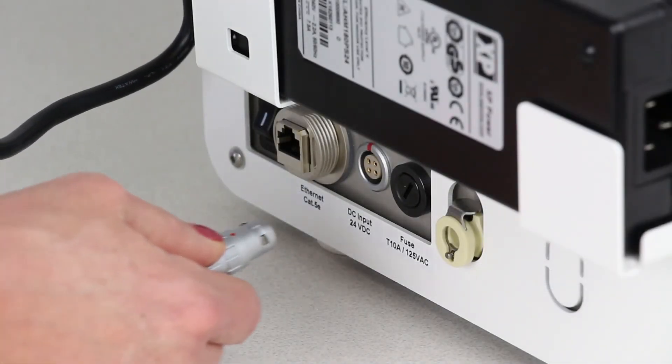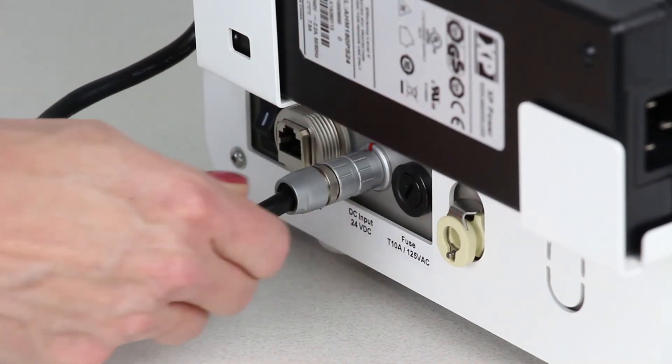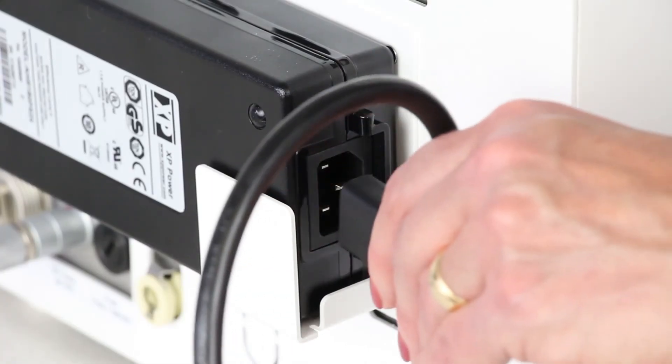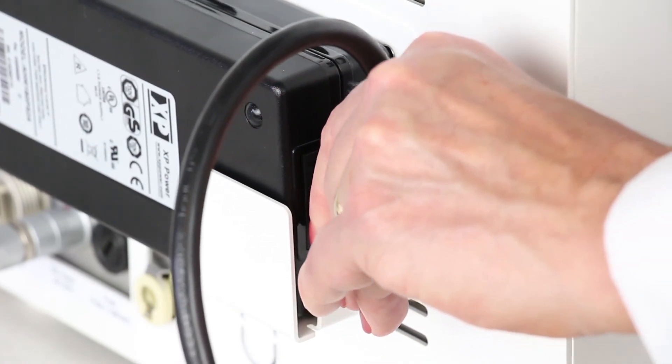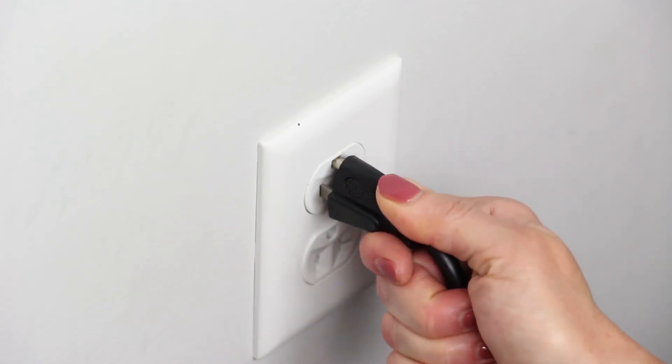Next, connect the plug to the 24V DC input power supply, and connect the power cord to the power supply. Then plug the power cord into a grounded outlet meeting electrical standards.